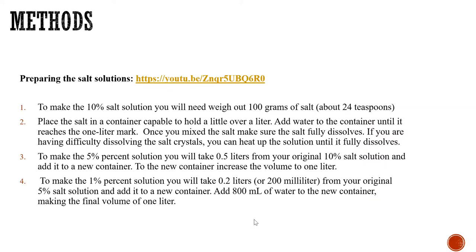Preparing the salt solutions for submersion of your eggs. Remember the question, what effect do the various salt concentrations have on the egg? To view how to prepare the salt concentrations, there's a link in your lab to measuring and creating your salt solutions. Here I have listed briefly the procedures.